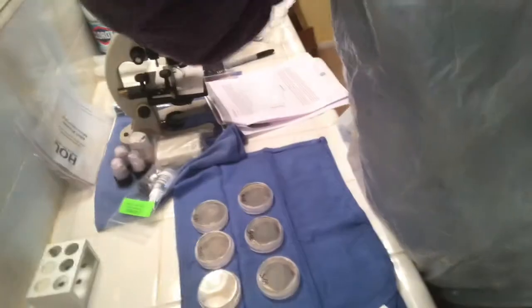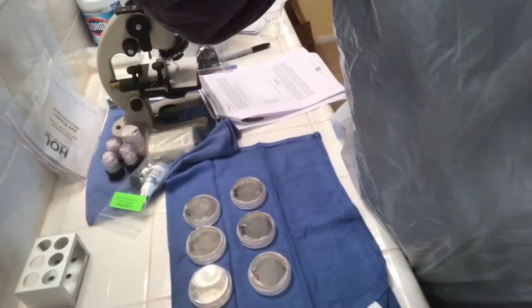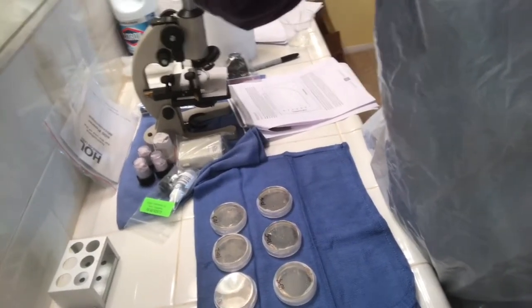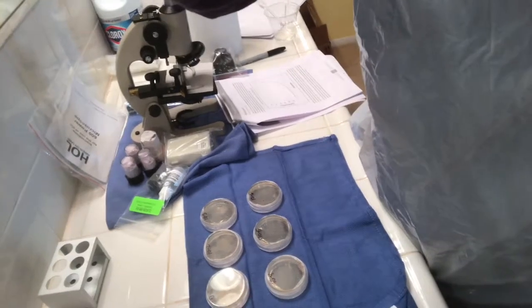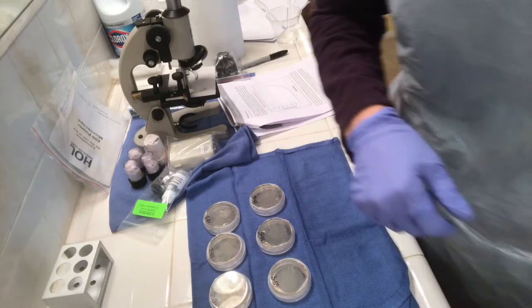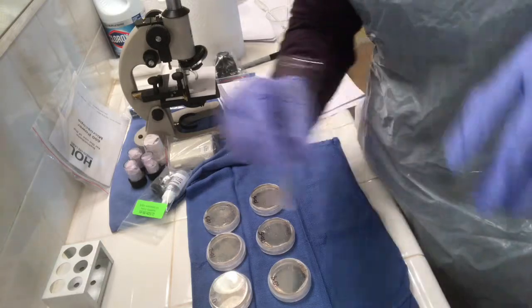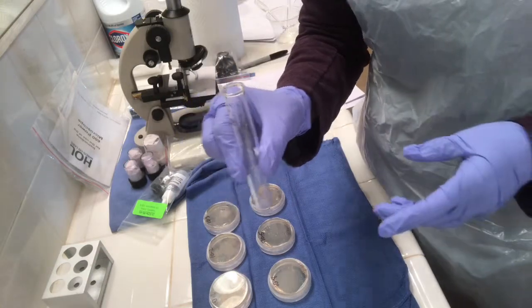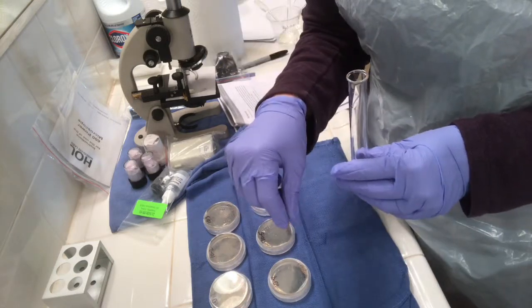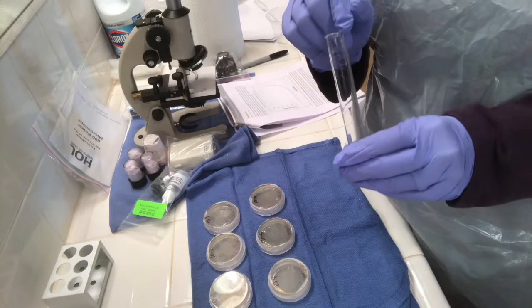My samples are down here, and I realized from the last video, because I watched it, that I didn't go over the serial dilution amounts. So the dilution amounts were 2.25 of the distilled water in the test tube, and then 0.25 of the yeast solution went into 10 to the 1.